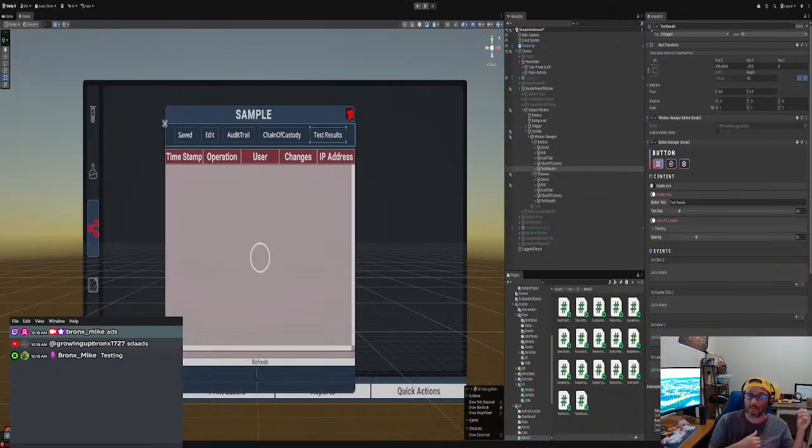Now, also, if you use AI to boilerplate your code, boilerplate means just write most of the code for you, and then you just go in and adjust it and all that, you always got to double check because it will make mistakes. It's gonna make a lot of mistakes. It's great for an assistant. It's not great to replace you though.